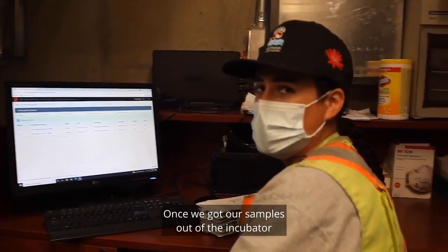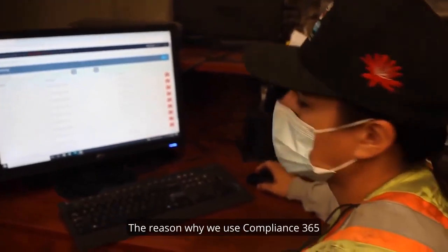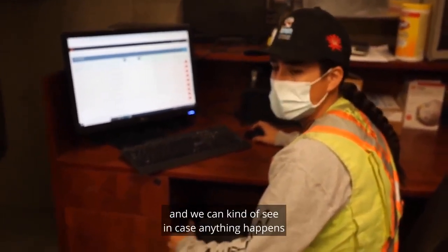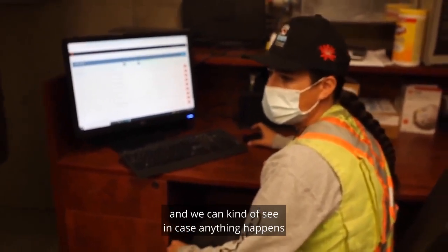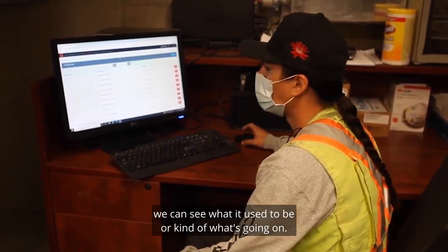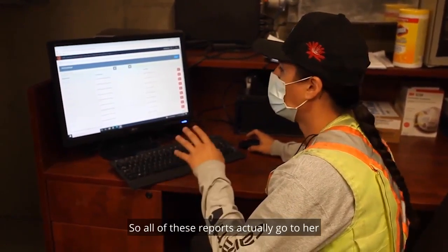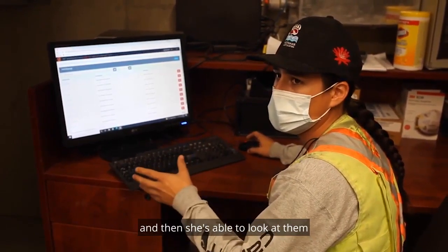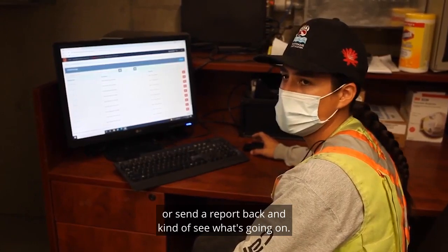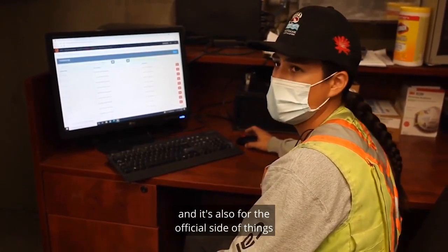Once we've got our samples out of the incubator, it's time to enter them into Compliance 365. We use it for record keeping — we can review past samples and see if certain areas aren't getting enough chlorine. It's also tied in with our First Nations Health Officer, so all these reports go to her. She can review them, contact us, or send a report back if anything comes up. So it serves both record keeping and official reporting purposes with our health office.